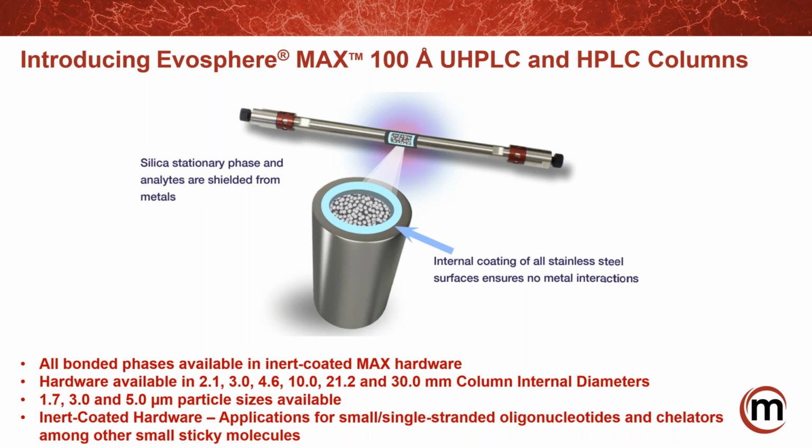So there is a premium on the cost, but when you look at that compared to how much it costs to keep on injecting your oligos and trashing them, it's sort of washed out. So the reason why we chose this is because this is sort of the de facto standard, the gold standard, for these types of separations.